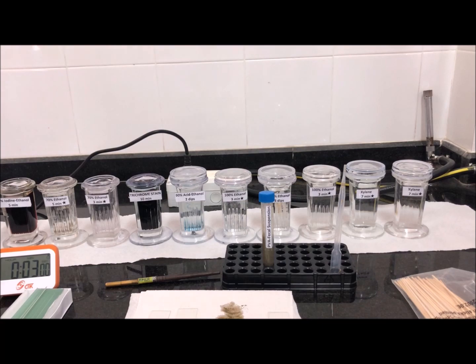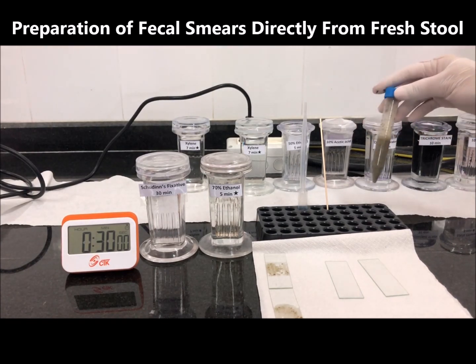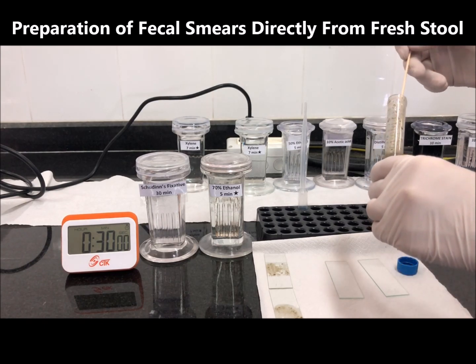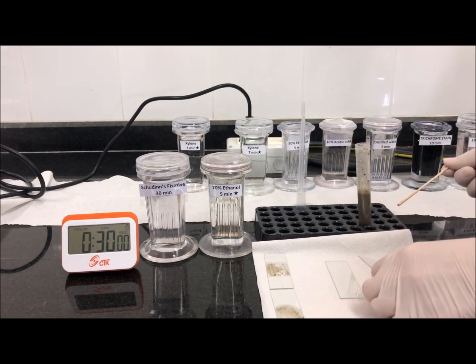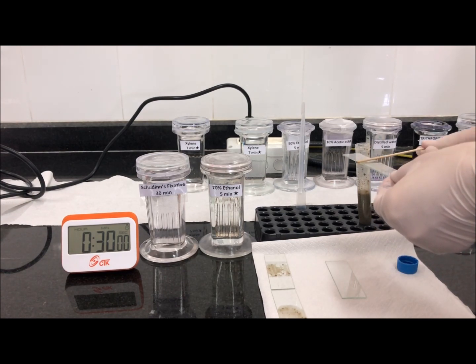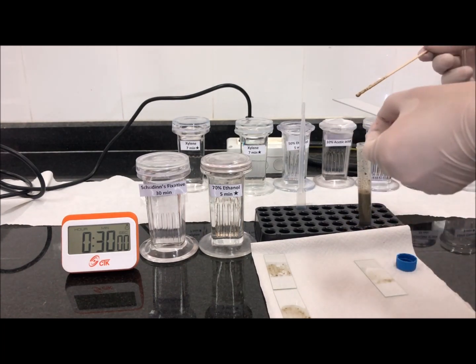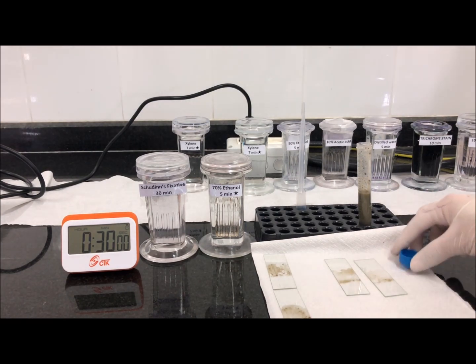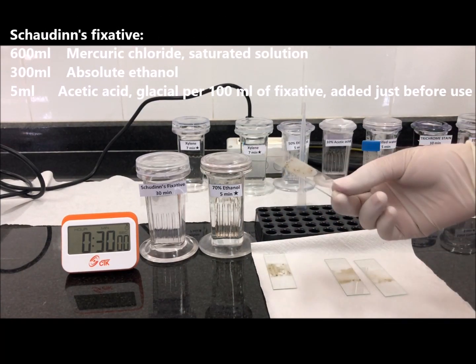Sometimes one would like to prepare a fecal smear directly from fresh stool rather than PVA-fixed stool. This is done by spreading fresh fecal material with a wooden applicator — not too thick, not too thin. This is fresh, almost diarrheal stool. Allow it to air dry completely, which may take up to half an hour, then place in Schaudinn's fixative.